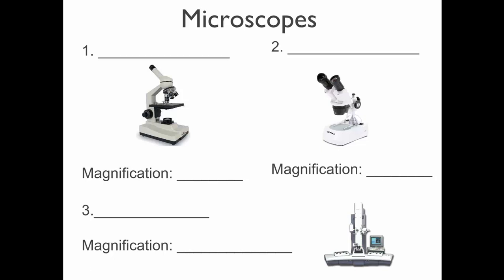so microscopes are tools. They look like these; these are the types we will use in class. And there's two different types here. I'm going to use this to sort of show you how they work and how they work differently. This type of microscope that you see here is called a compound light microscope. This is the microscope we'll be using most often.